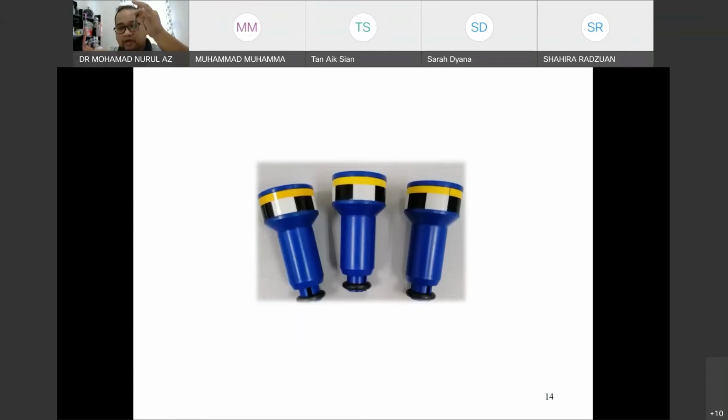We usually use ethanol and soft tissues to wipe the surface because we want to remove the grease. After that, put it carefully inside the spinner and make sure you don't touch this black and white area, because when the NMR spins, it calculates how many RPM, how many circles it has done, using binary code.